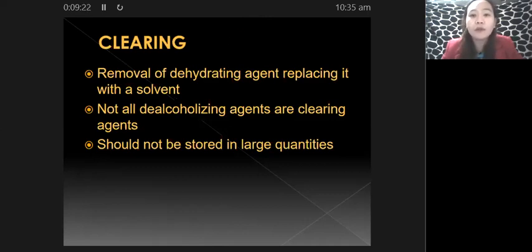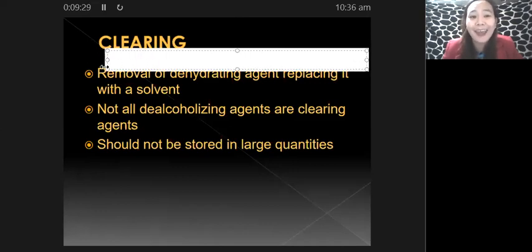Since one of the purposes of clearing is to remove your dehydrating agents, another term that we use to refer to the clearing process is dealcoholization. Okay, so from the term itself, dealcoholization, you are removing your alcohol.